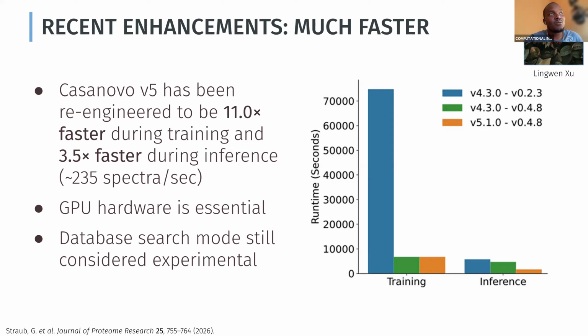So for the deliberate use of the sinusoidal encoding when you're looking at the spectral peaks, because we know that the traditional transformer also uses sinusoidal encoding within the language, did you just look at the work that the authors of the transformer did, or was it really deliberate or intentional?